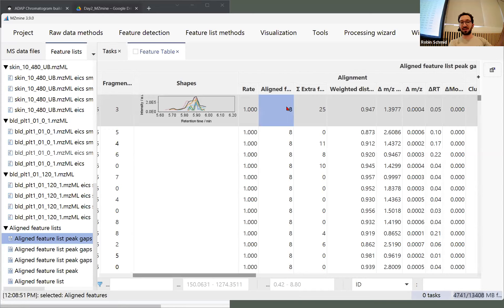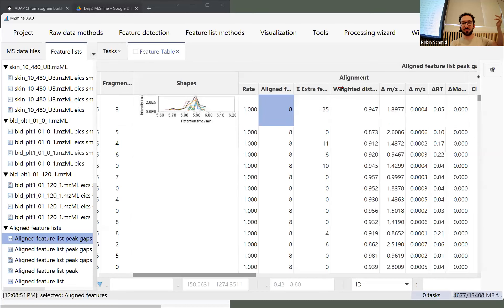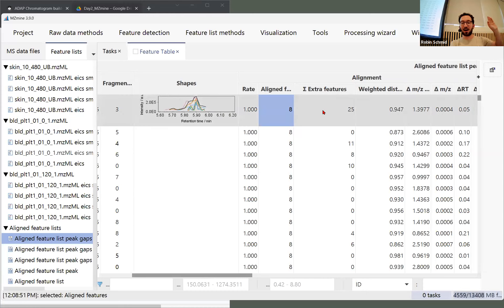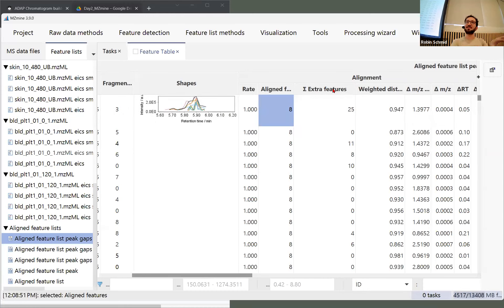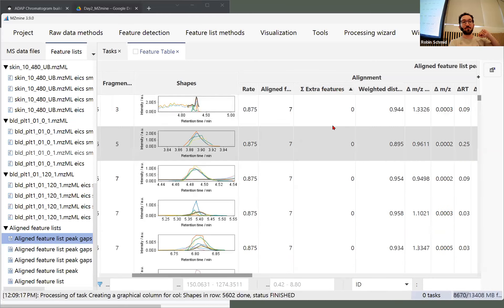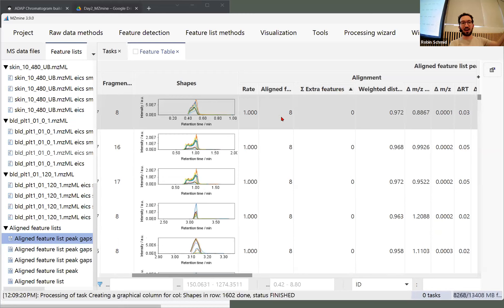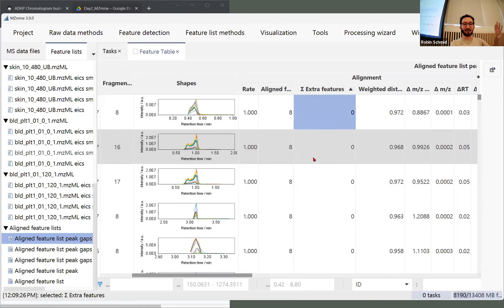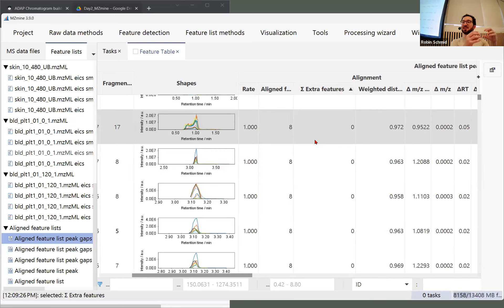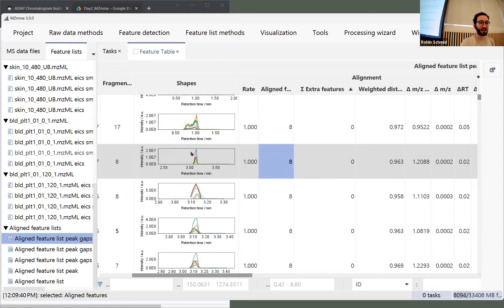In the alignment columns, we have multiple columns that give an idea of how well the alignment worked. There's the alignment rate — click twice to sort from maximum to minimum. An alignment rate of one means 100%, aligned in all eight samples. The aligned features column shows all eight samples had one feature aligned. I want to show how you can use the extra features column to see the maximum retention time and m/z differences across the whole feature table.